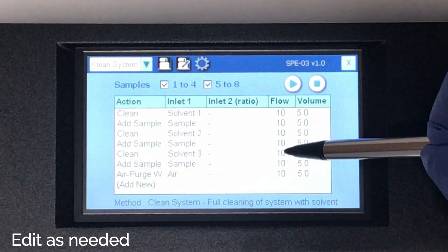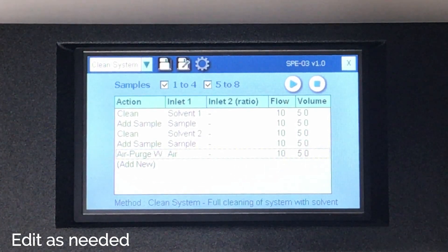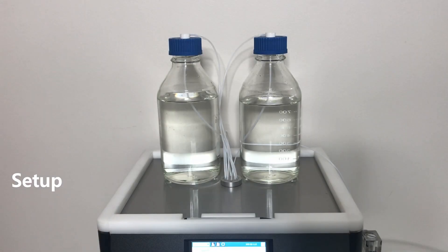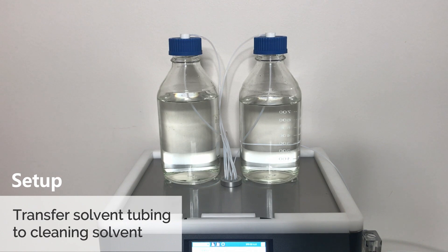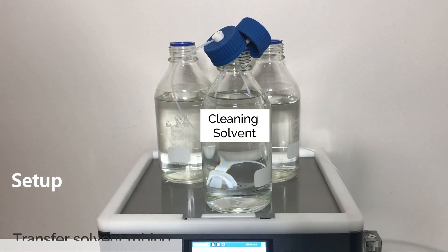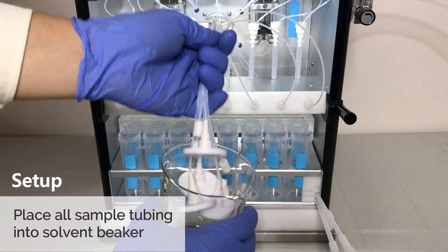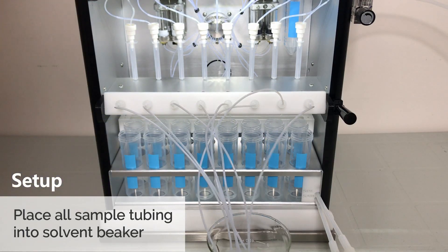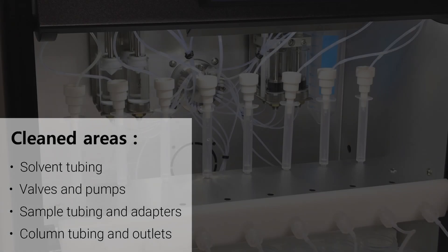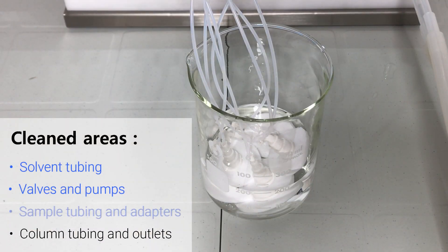Edit the method based on the number of solvent channels required. The setup for cleaning is as follows: transfer all the solvent tubing to a bottle containing the cleaning solvent, insert blank SPE columns onto the column rack, and then place the sample tubing into a beaker containing the cleaning solvent. During the clean step, the cleaning solvent is drawn into the valves and pumps, and then pushed out through the sample tubing.